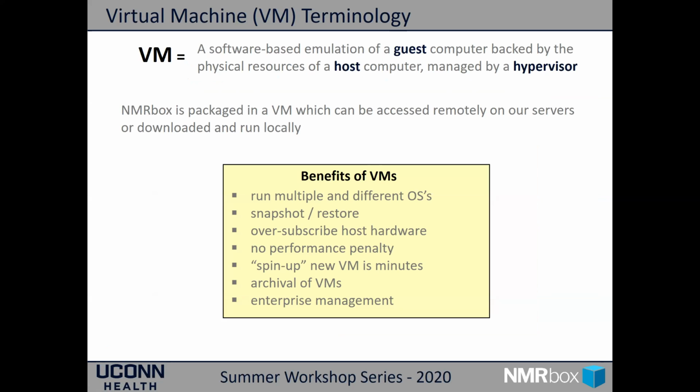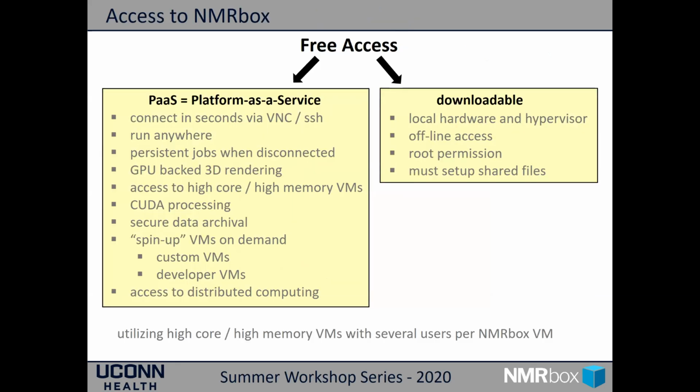So NMRbox relies on VM technology, virtual machine technology. The NMRbox platform is packaged as a virtual machine, and it can be accessed remotely on our servers, or you can download it and run it locally. And it's free for all academic and nonprofit and government labs.